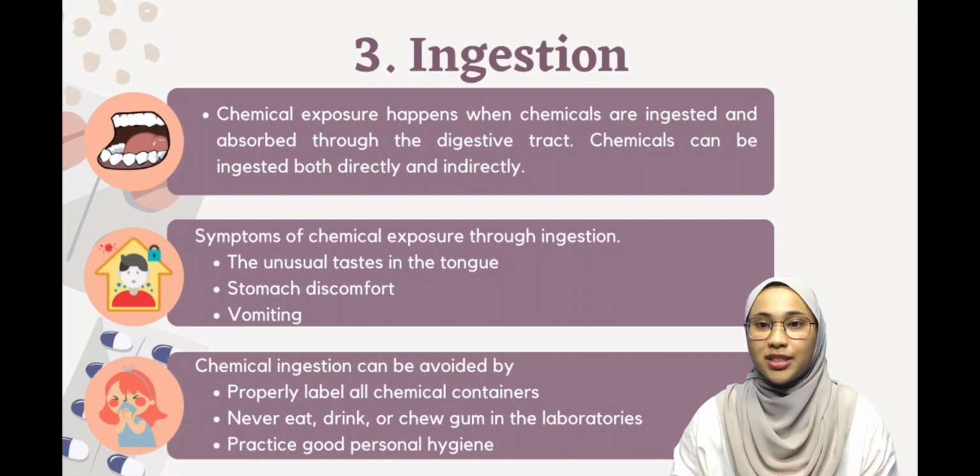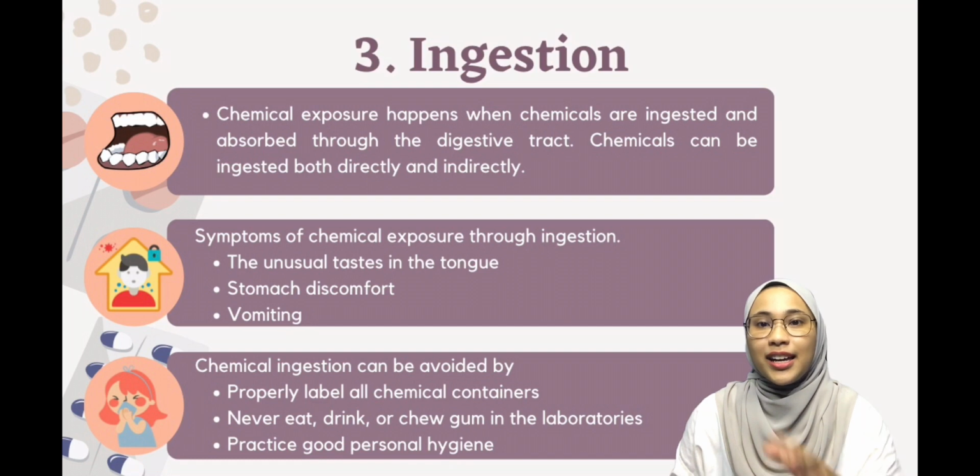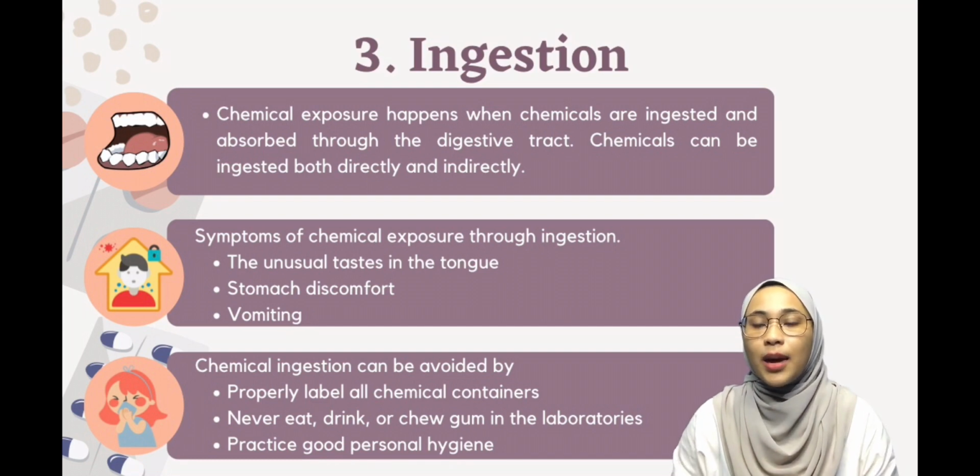a chemical exposure. Thus, an unusual taste on the tongue, stomach discomfort, vomiting, and a general sick feeling are all symptoms of chemical exposure through ingestion. However, it can be avoided if all chemical containers are correctly labeled.